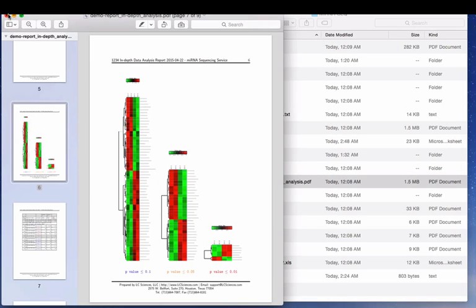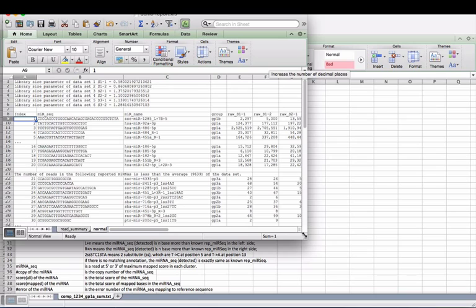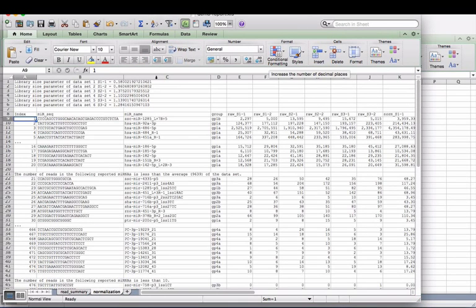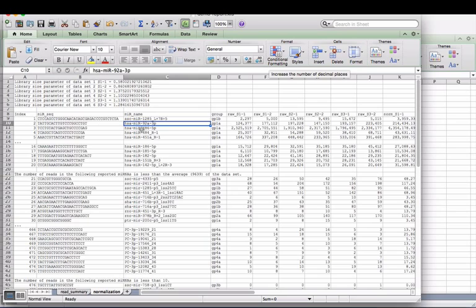Then when you look at the demo report here, or the actual data that you get, and look at the microRNA names, you see sometimes microRNA names that are not specific for your species. And so that confuses a lot of customers as well. This happens because during the initial step, when we try to map the data, we map them to miRBase. And if there's a microRNA that is not discovered and not described for your species yet, however, it is, let's say, described for human, and you work with mouse, and it has not been described yet for mouse, then it will be shown here as the human, with a human name.